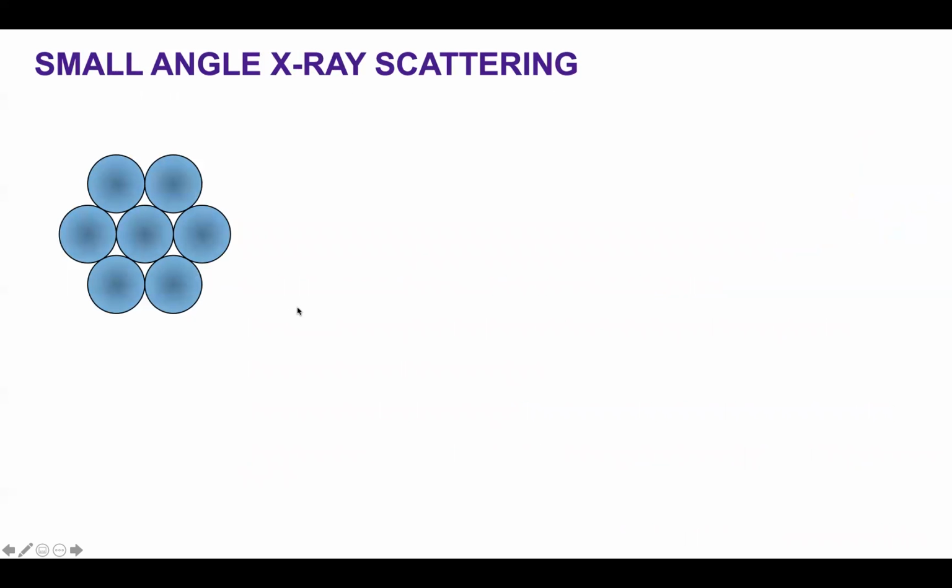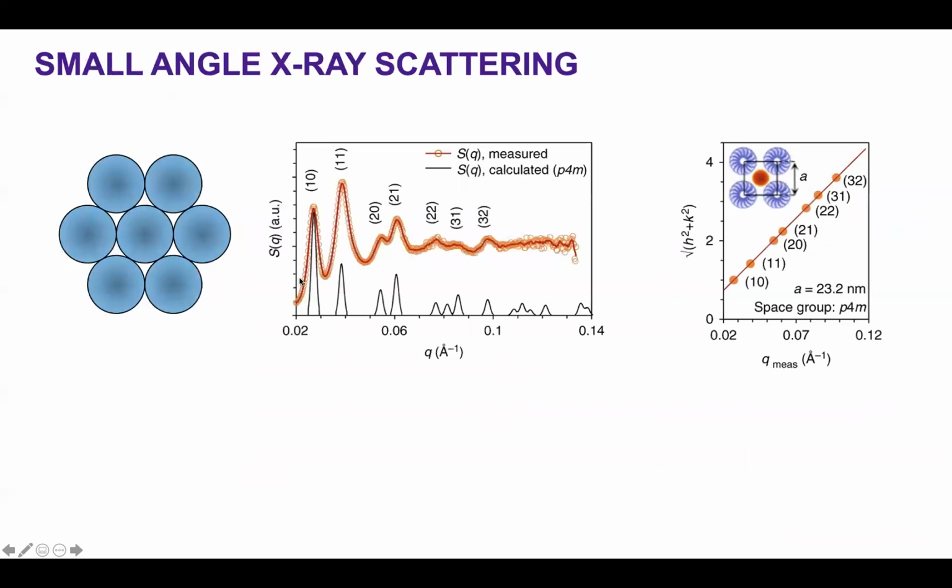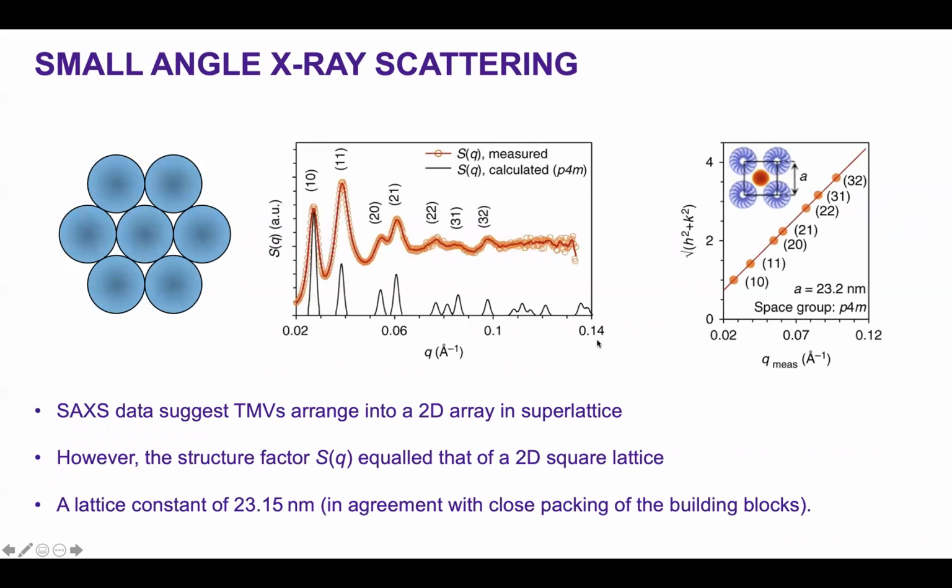But small angle scattering often gives you a lot of information, but if there's a new structure, it's challenging to explain why we observe the structure. If you take rod-like particles, it is expected that they form hexagonally close-packed structures. But in our case, what was observed is that we have a square lattice. And it is rather surprising how the rod-like virus particles can form a square lattice.